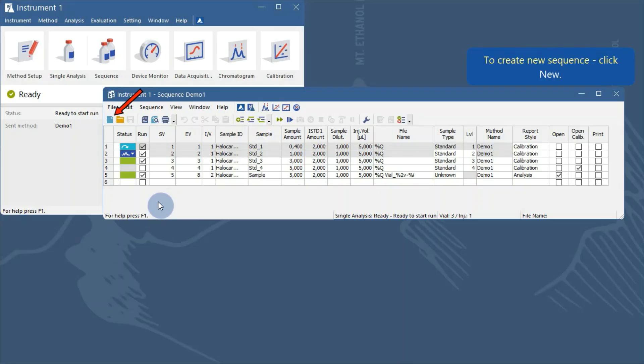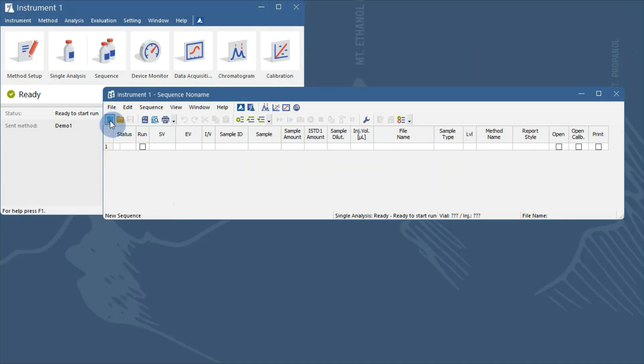In the Sequence window, click New to create a new sequence. Fill in the first row as you need and pay extra attention to the columns that will be the same for the whole sequence, for example, method name.